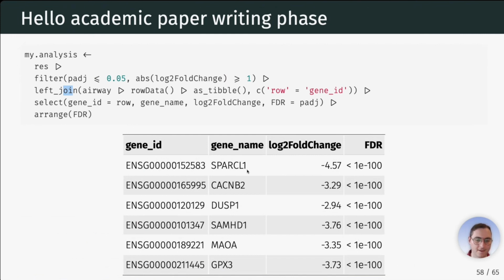L1 had much lower log fold change, so 2 to the power 4, higher expression change with a fairly low false discovery rate. And that is something where we can get excited and look into, okay, what do we know about this gene? Has that been described beforehand to be affected by this drug? Can that maybe give us a new insight into what is going on in the cell in the case of some sort of asthma-related disease? And that is where then the science really gets into it.